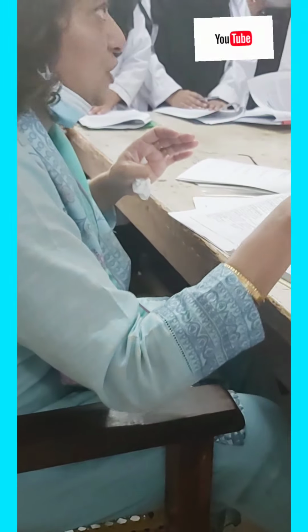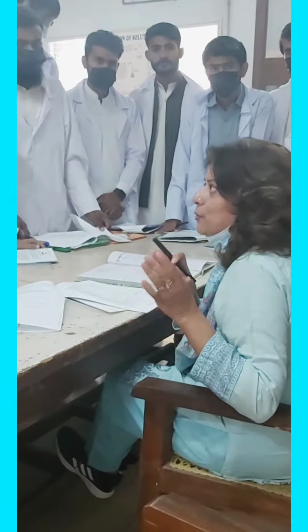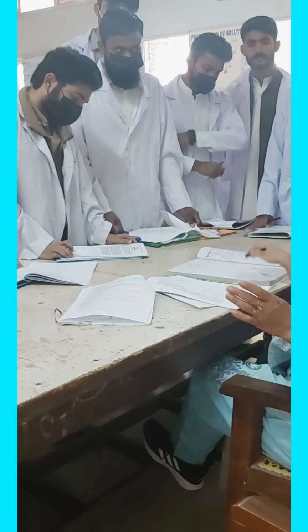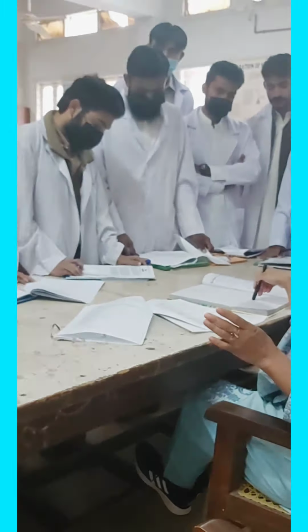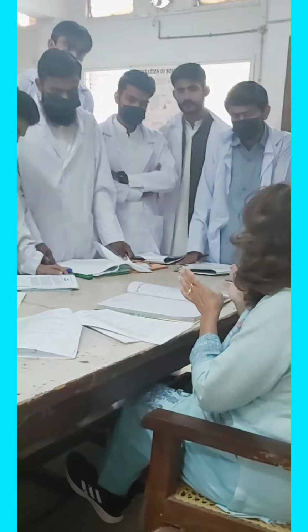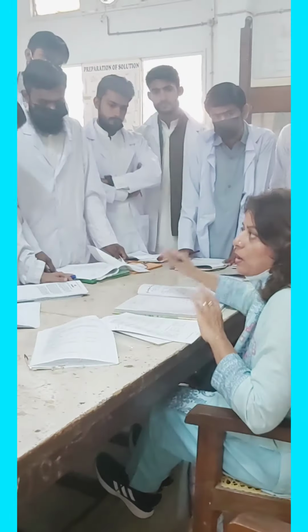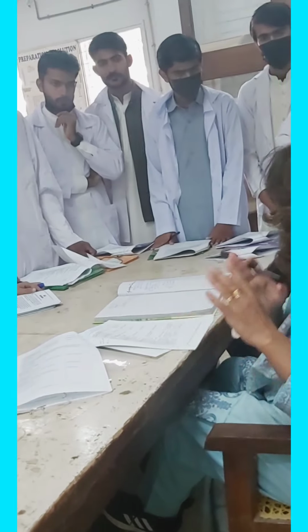It was white in color. It has such a type of odor. It was acidic, right? It has unsaturations. So you have some data in your mind, and on your journals also, and then you jumped to the next step, that was detection of elements, and you now know that your compound was deficient in nitrogen, it doesn't have sulfur, it doesn't have halogen. So this is all the data, and in our case we know it's a known compound. But what happens when it's an unknown compound? You are only left with a powder and your previous data, the first step and the second step.